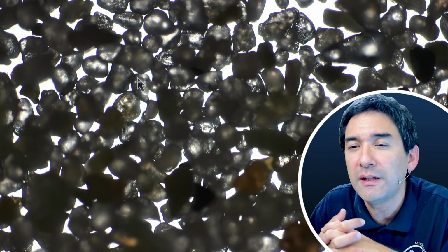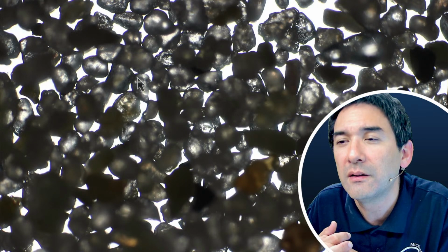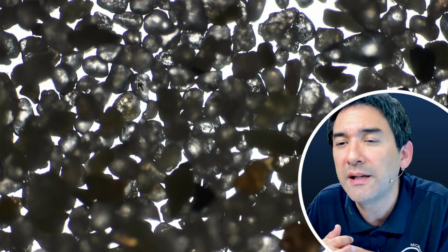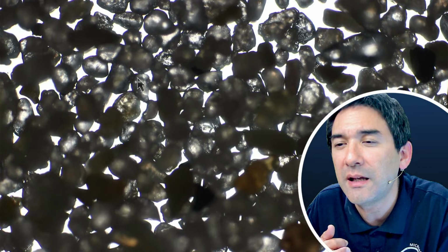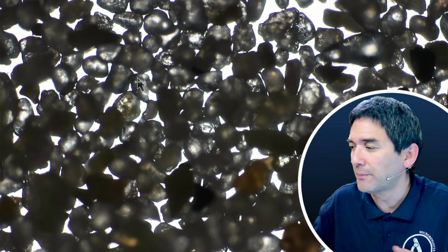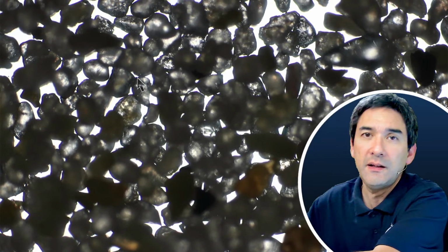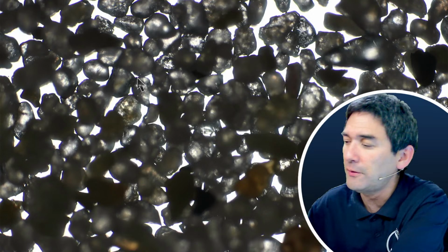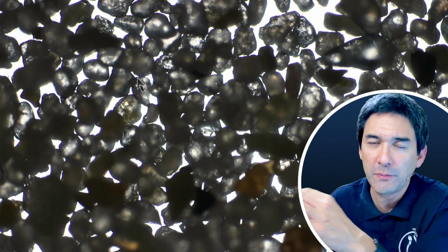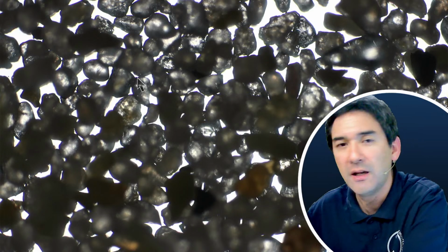Yeah, so there's some comments. Yes, we keep insects in A and B epoxy in a latex glove. Okay, yeah, so this is basically simply something that can also be tried. I think it's not a problem for stereo microscopy. If you want to use it for compound microscopy, the refractive index of the epoxy might also have some kind of an impact. But you know what?